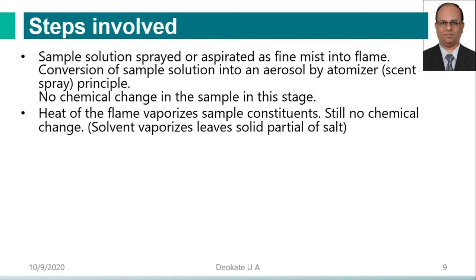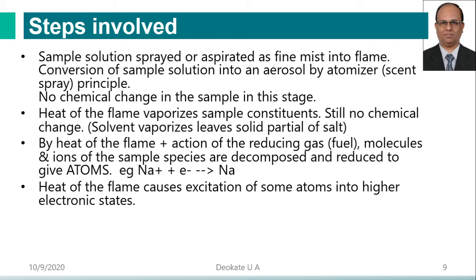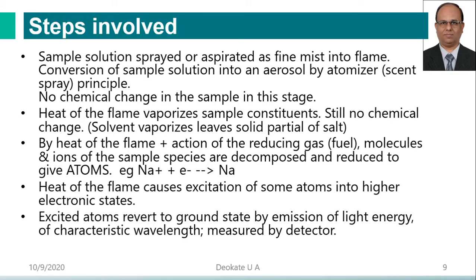The heat of the flame vaporizes the sample constituents, that is, it vaporizes all your solvent. There is still no chemical change; the solvent vaporizes, leaving solid particles of the salt in the flame. By the heat of the flame and the action of the reducing gases, that is fuel, molecules and ions of the sample species are decomposed and reduced to give atoms. Here the actual atomization takes place. They will be converted to atoms. Sodium ions, by gain of electrons, will be converted to sodium atoms. The heat of the flame causes excitation of some atoms into a higher electronic state, which is called the thermal excitation state.